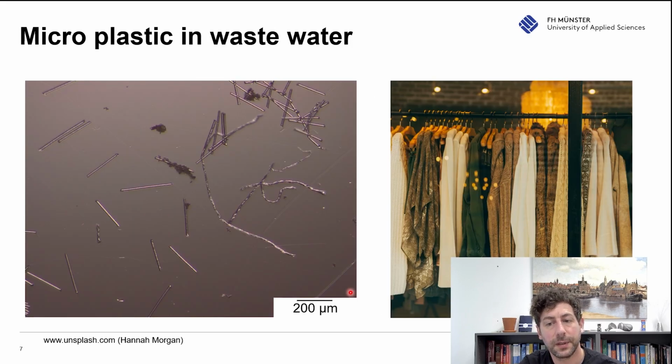And the third example you see here, and this is microplastic we are investigating. Microplastic comes mainly from textiles. And when you put the textile into the washing machine, the microplastic is washed out, and you don't want this. This is one product property. And on the other hand, you want to filter it. And to filter it, you need to understand, and you see these rods here, right? These are really microplastic particles which we need to filter out of the water. Okay, so with these 3 examples, I hope you get an idea that particle size is a really important measure.